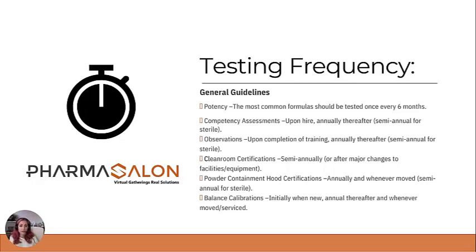These are some general guidelines for your testing frequency. These are partially my suggestions, partially from USP or other standards. Make sure that you look at your state rules, that you look at USP, that you look at, maybe if you're PCAB accredited, what the requirements are there. You want to make sure all your bases are covered, okay? Specific to you and your pharmacy and whatever accreditations and licenses that you have.